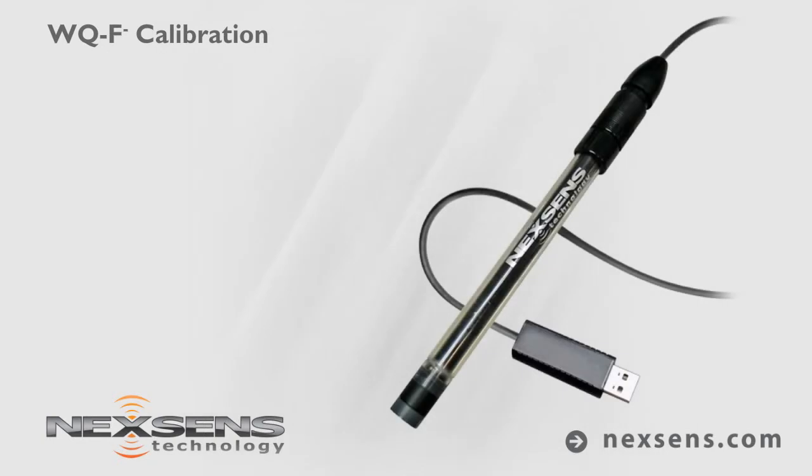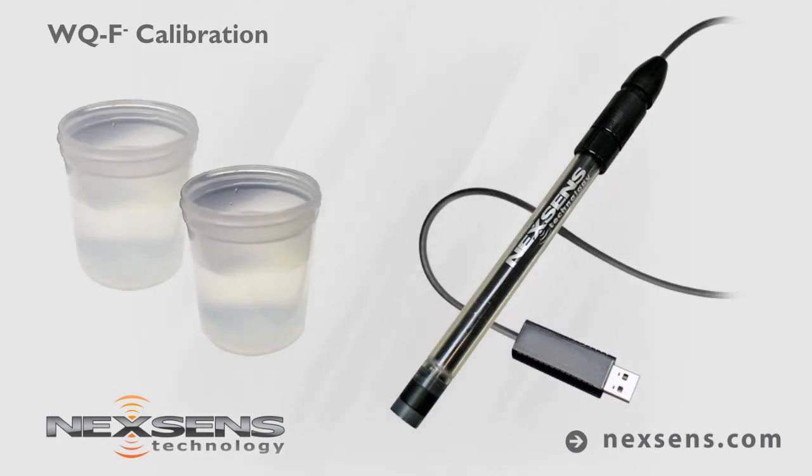Calibration and measurements with the NexSense WQ Fluoride sensor are quick, easy, and reliable. The software supports a two-point calibration, which is typically performed above and below the expected measurement range. For this demonstration, the sensor will be calibrated using 10 and 100 parts per million standards.